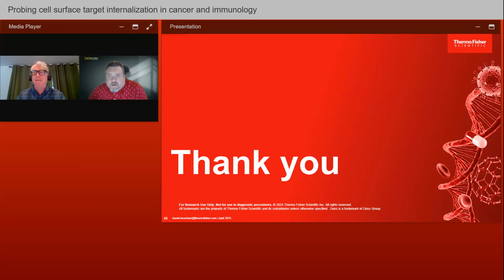All right, and looks like we'll end on this one as we're getting close to time. What are some relevant controls for the specificity of a particular ADC or labeled cargo for binding and internalization as its cognate receptor? Boy, I hope I satisfied that question in the deck, because the specificity is of great concern to us.